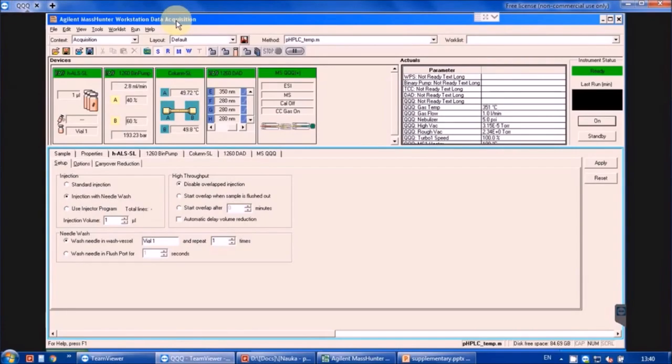The first step in development of a preparative method is optimization of the mobile phase gradient in order to perform separations with good resolution, so that each compound is isolated as pure as possible and requires little additional workup, and within a reasonable amount of time, so that solvent consumption and time or workforce consumption are minimal and a large number of samples can be processed. Initial parameters are set from experience.